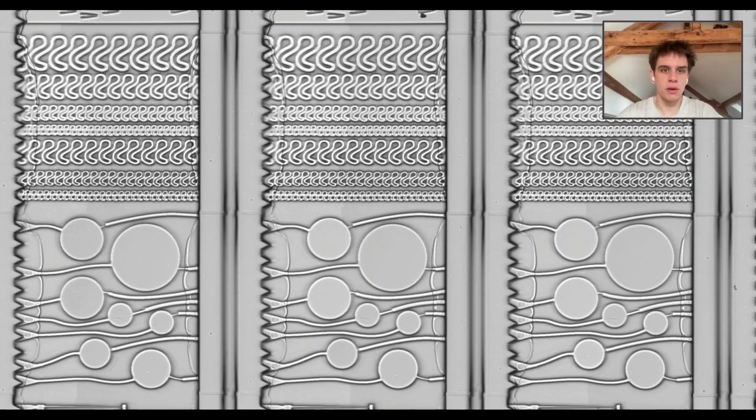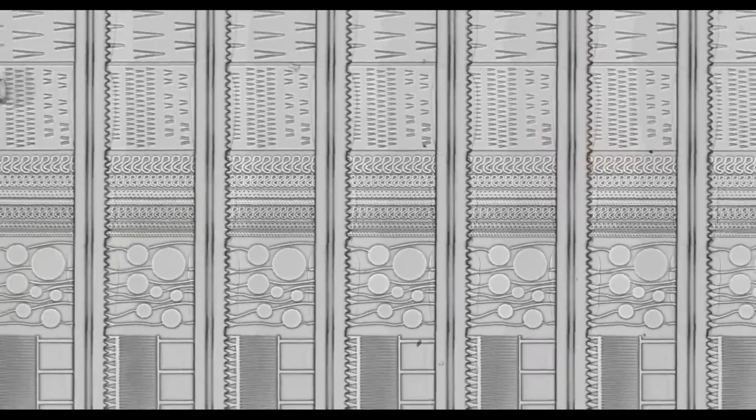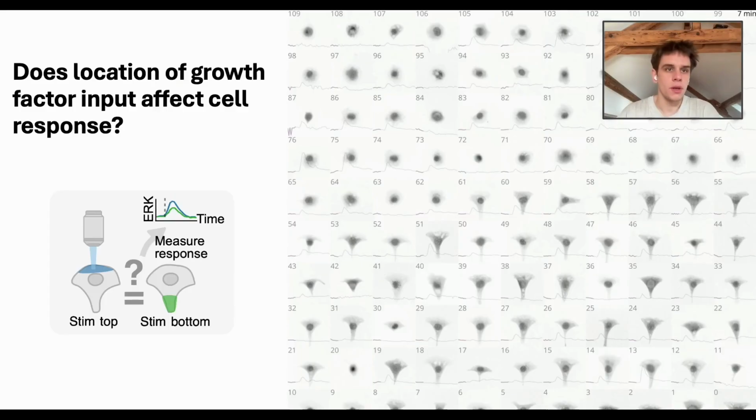Here you can see a microfluidic chip that I printed. You can see there's really micrometer resolution, but also centimeter scale. Using the microscope stage, we can use a high resolution microscope objective to print one field of view and then move the stage to pattern a whole chip, with really centimeter scale chips.